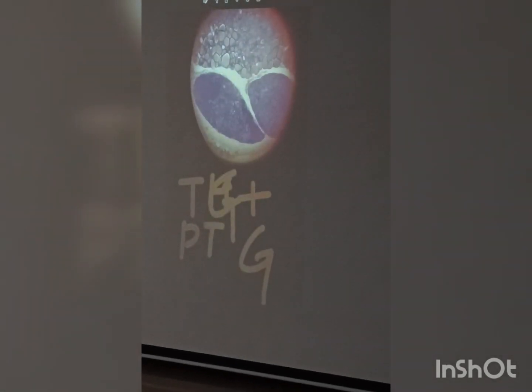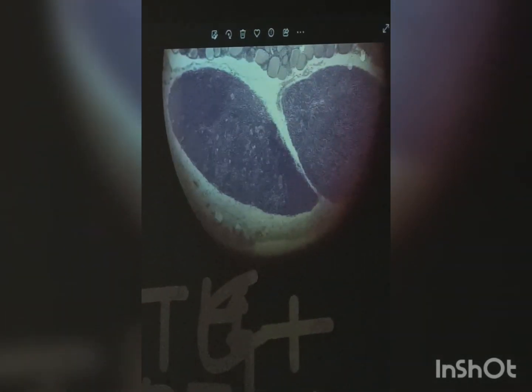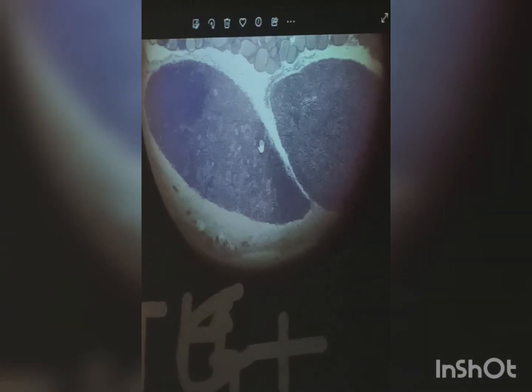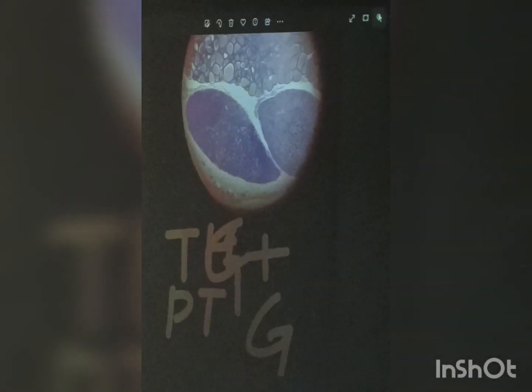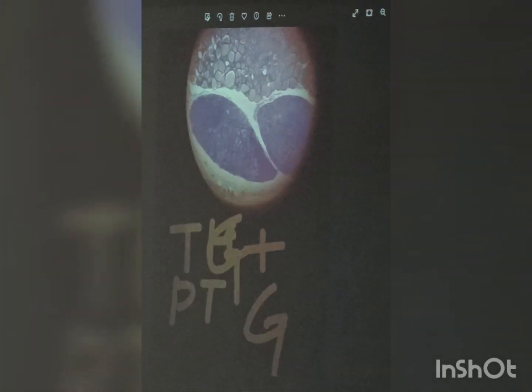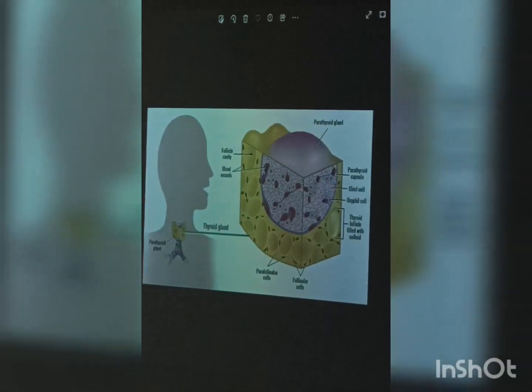That was a slide we will see in practical, but this lower purple portion is the parathyroid, right? The above portion, which shows all of this, is the collection of so many millions of thyroid follicles, right? So we can see two slides in one place.